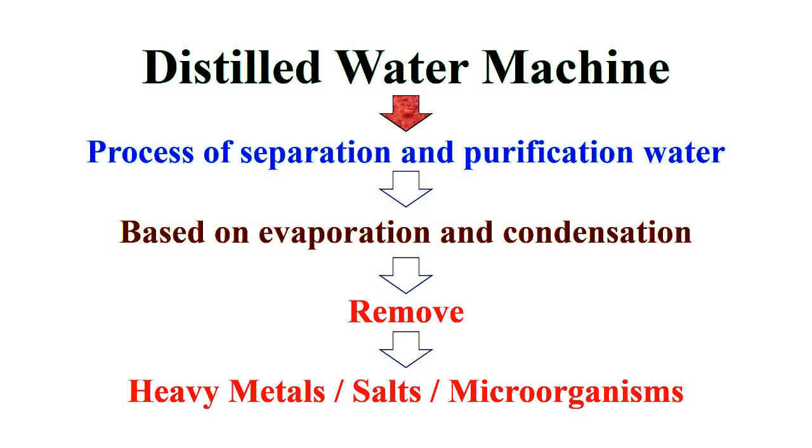Distilled water machine depends upon the process of separation and purification of water, based on evaporation and condensation, to remove heavy metals, salts, and microorganisms.